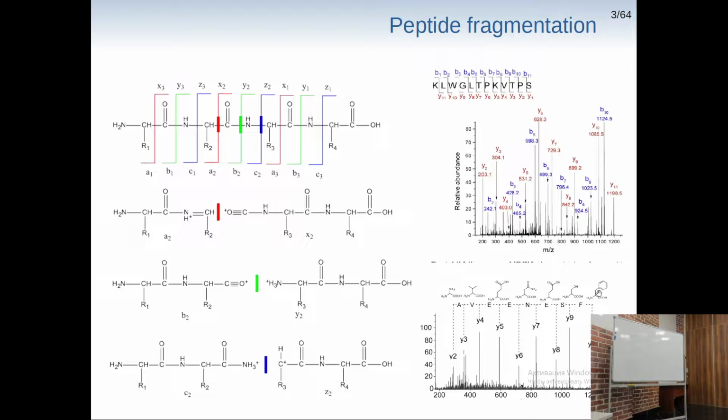So as you can see, in some cases it is possible to do de novo sequencing of a peptide, but not always. With proline, there is a gap. Leucine and isoleucine have exactly the same mass, so it's not possible to distinguish between them. And also, some pairs of amino acids, though they are different, will have almost the same weight. So there are problems.